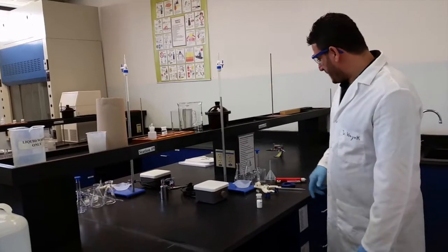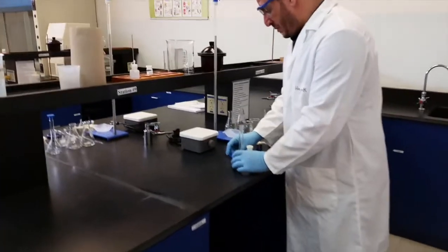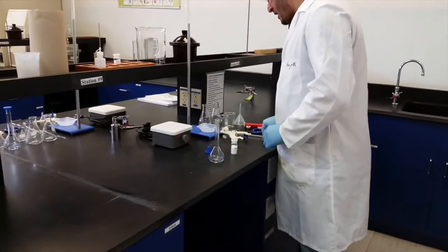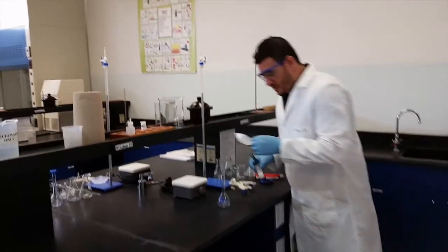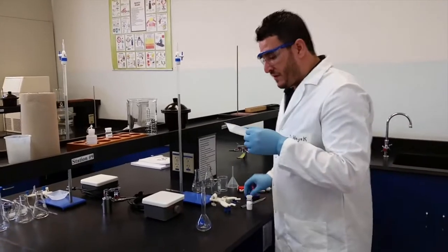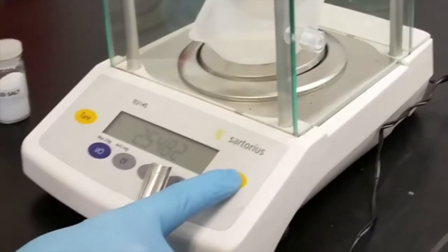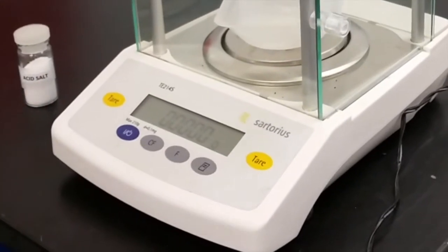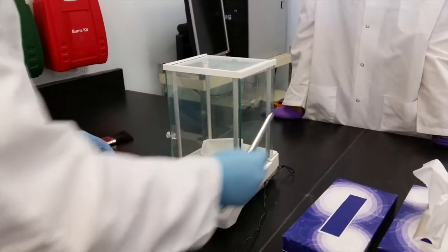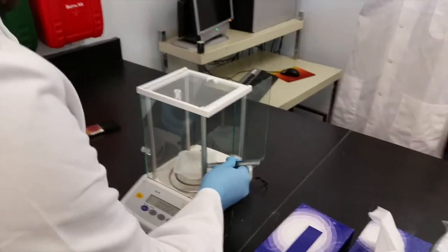To start, we need to prepare a solution of acid salt. Now, preparing a solution is not something new for you. You will need to weigh around 1.5 grams of the acid salt.